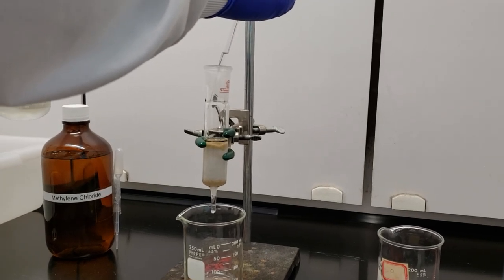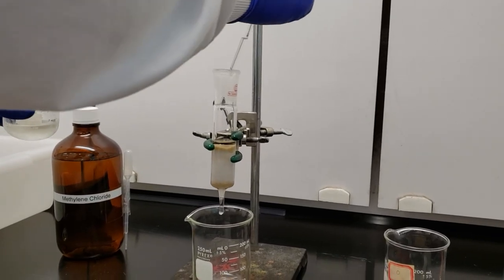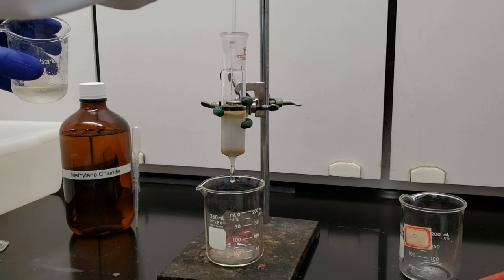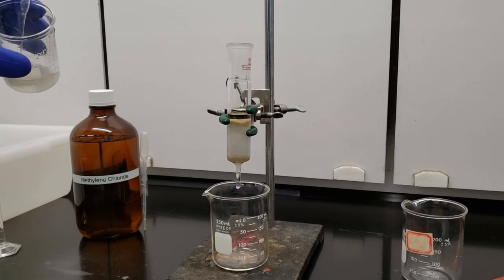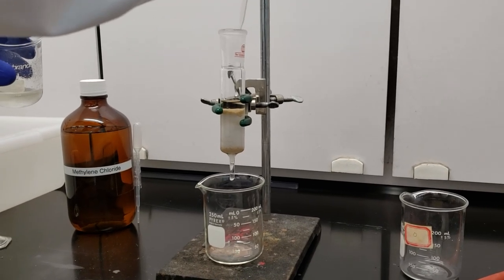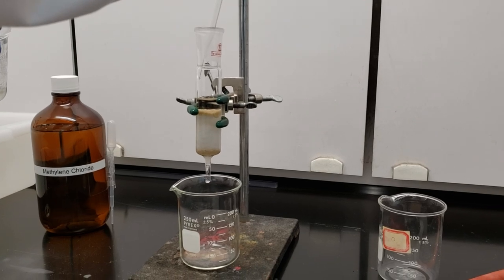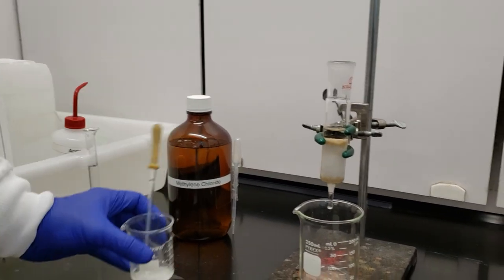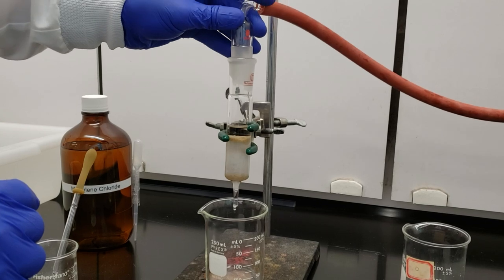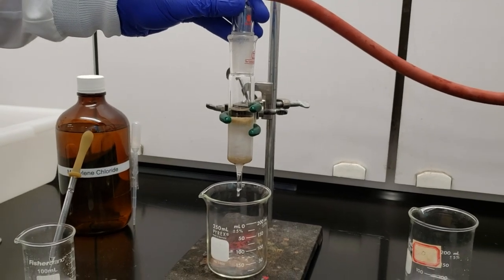This is our dried ether solution from the previous step. If we get a little bit of the drying agent into our pipette, that won't hurt anything. The drying agent will actually be trapped by the sand on the top. We're going to push this down just a little bit to get it onto the column before we put the next batch on. And again, we're catching all the liquid that comes out into our pre-weighed 250 ml beaker.